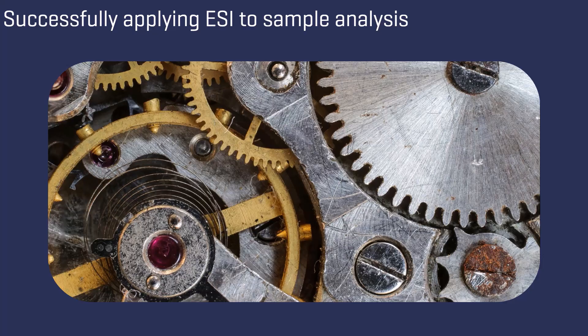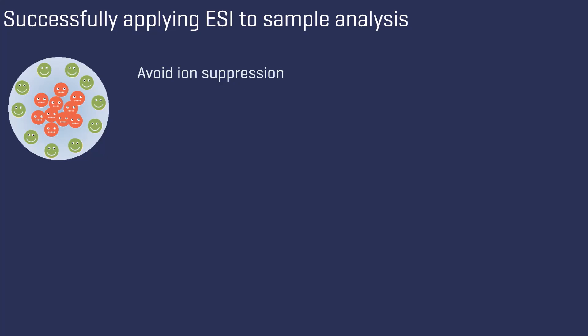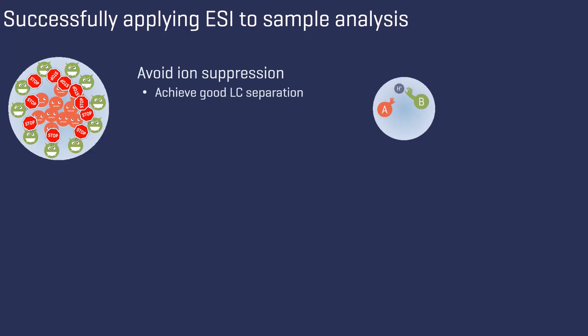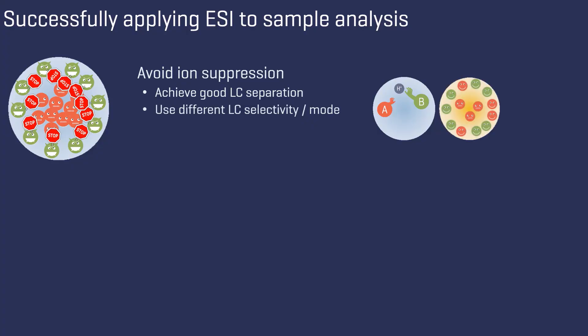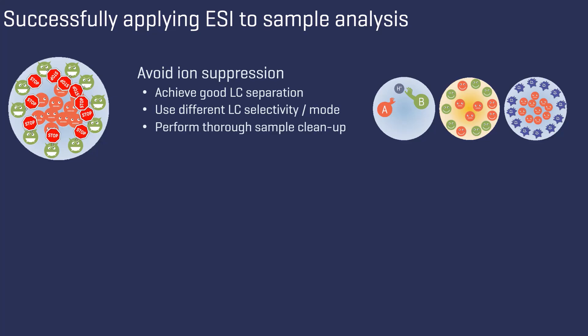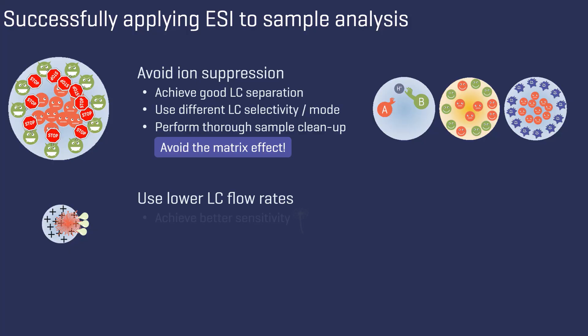How can we apply the knowledge we have acquired to effectively perform sample analysis in practice? First of all, it is important to prevent ion suppression. This term refers to the case where our target ions cannot effectively compete for positioning at the droplet's surface during the electrospray process. To address this, it is beneficial to achieve good LC separation of the analytes. You can also try using another LC selectivity or separation mode to increase the content of organic solvent at the time when your target analyte is eluted. In addition, it is advisable to put effort into the sample preparation. The less matrix in your sample, the fewer molecules compete for the place at the surface, also referred to as matrix effect. You can try lower flow rates to achieve better sensitivity.